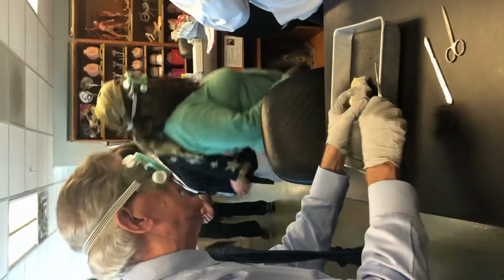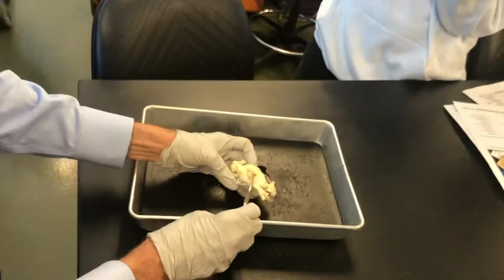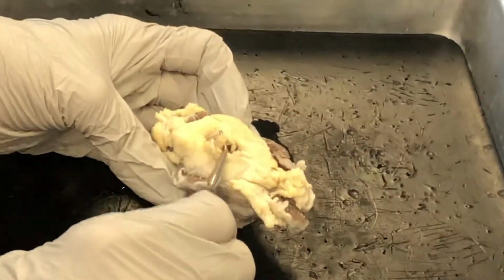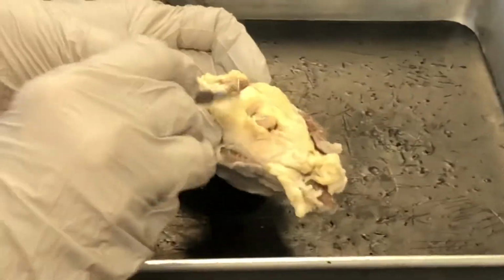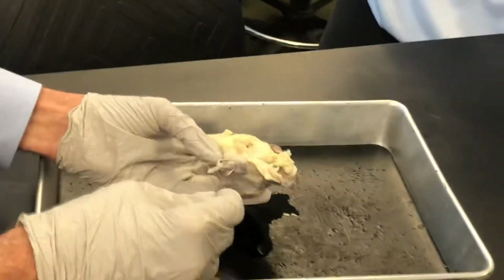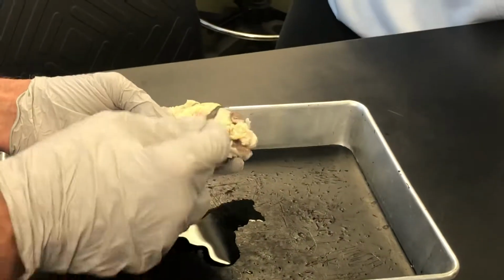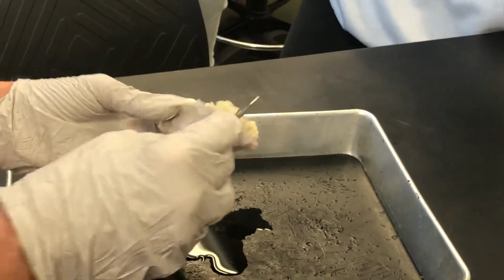Okay, very quickly. See this structure right there? That's the optic nerve, a bundle of axons. See these dark objects, this dark one, that one, that one? These are the extrinsic eye muscles, the rectus and oblique muscles, which you do not need to recognize individually on here. But you need to know that these are extrinsic eye muscles and that this is an optic nerve.